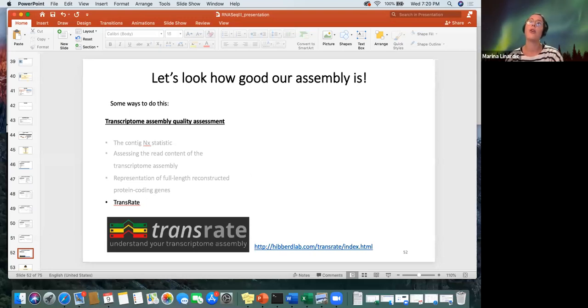And then it also analyzes the assembly by aligning the contigs against proteins or transcripts from species. So practically all 3 parts that I mentioned before, it has a different methodology, but it does the same thing. And then it gives out some metrics that we will talk about later when we actually get our hands on practice.